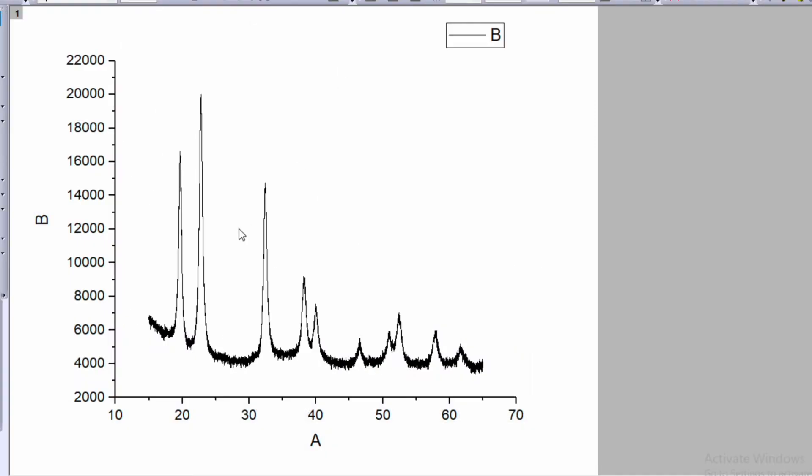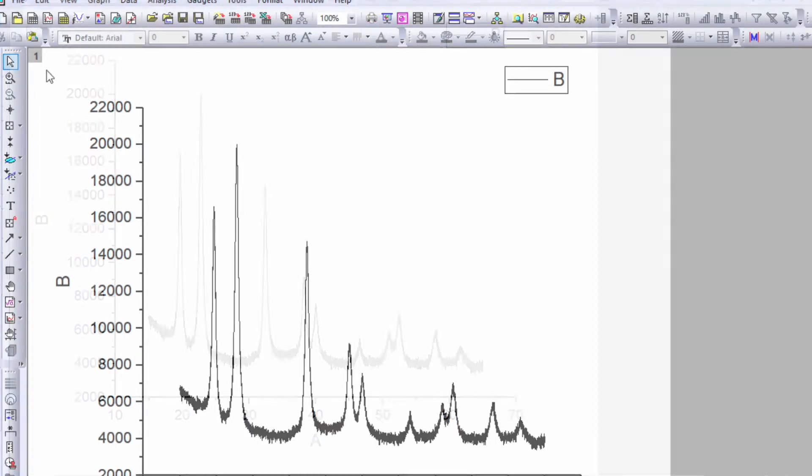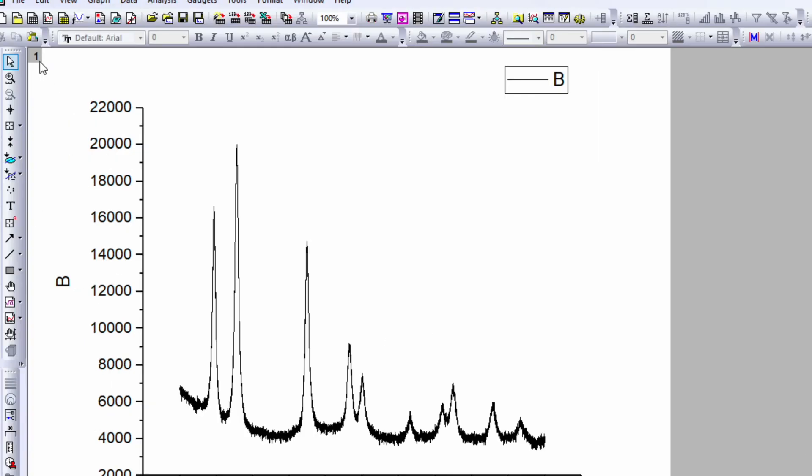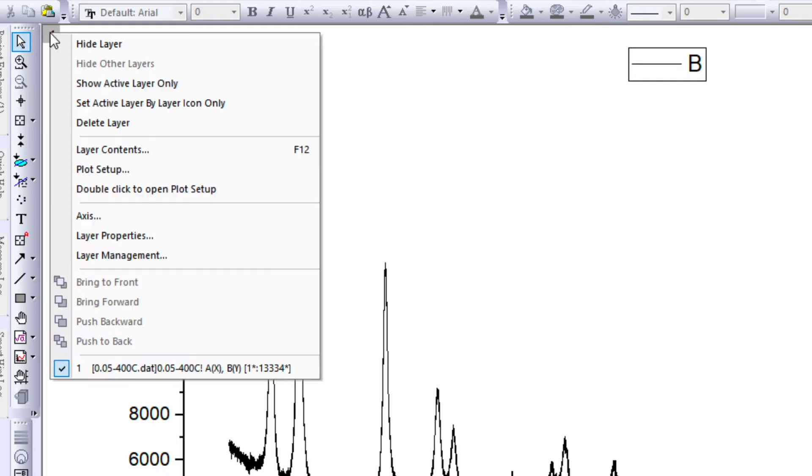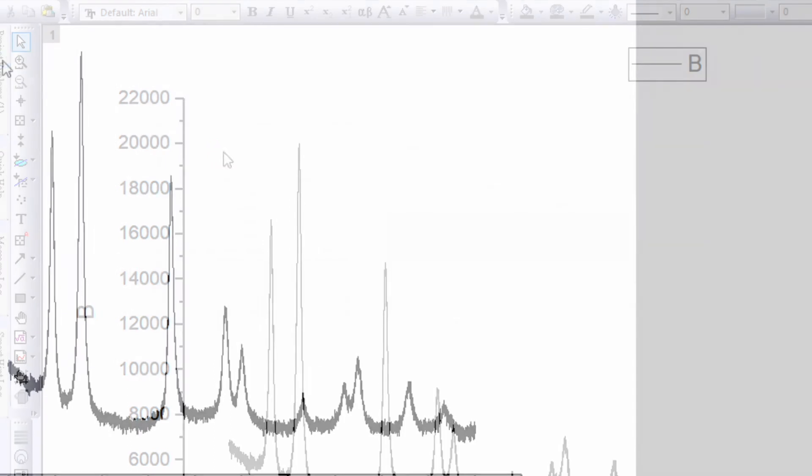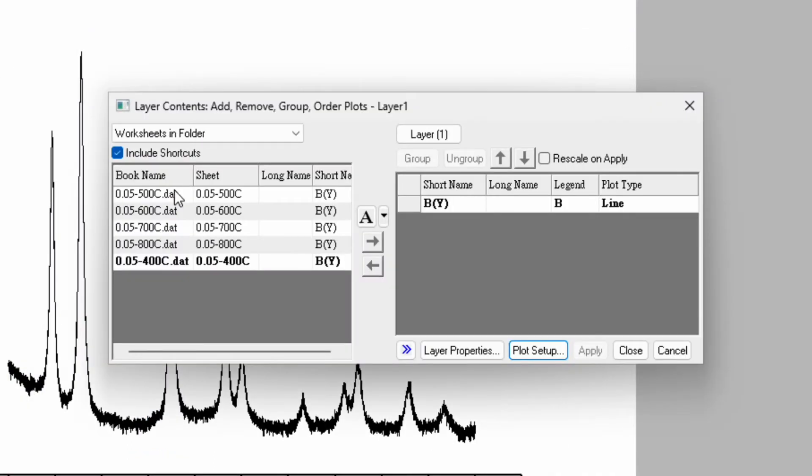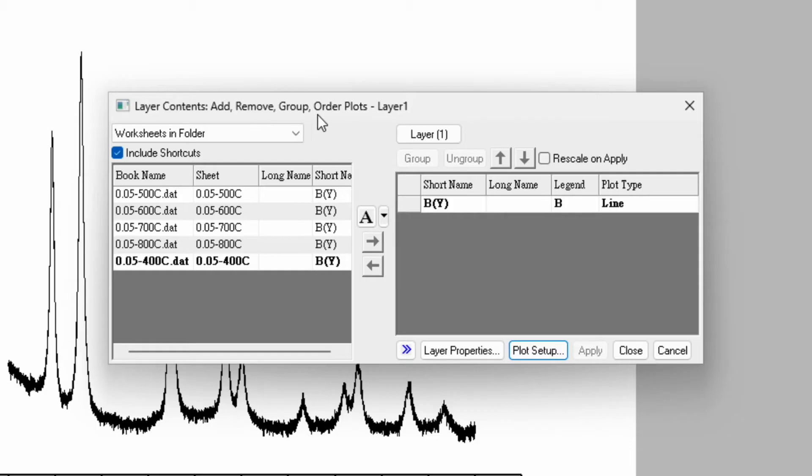You'll see a graph where the y-axis is intensity and x-axis is two theta. In the left top corner, you'll see number one - that's layer one. Move your cursor on layer one, right-click, and go to layer content. The shortcut key is F12. A window will pop up showing layer content - add, remove, group, order plots.